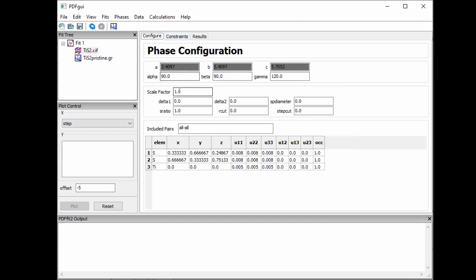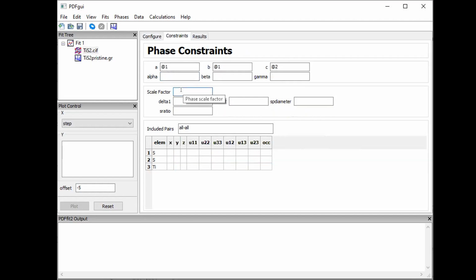Also, I mentioned the scale factor, and in fact this is the first one to start with, but just as a personal habit, I normally name it this 100 parameter. And we only need to do one, right? We have this local scale factor. We also have the global one. We only need to define one. So I already would define this one. Okay, and we'll leave that one for later, and we start defining their U values.